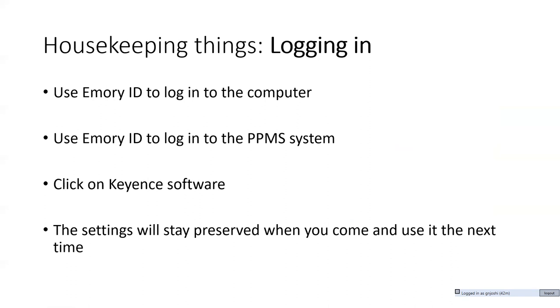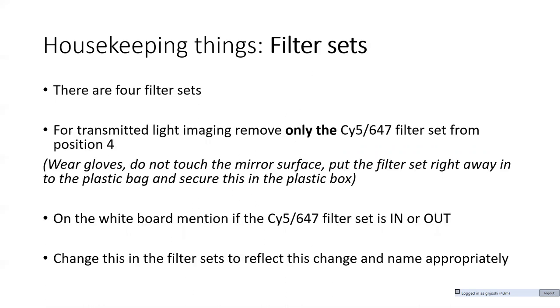All right, so some of the housekeeping things on this computer. The first thing is you use your Emory ID to log into the computer. Once you log into the computer using your Emory ID, you will need the same ID to log into the PPMS system. Once you are logged in, click onto the Keyence software and you're good to go. It's just that simple. Except for the first time when you are here, I will configure the system so that you don't need to do anything else, which is something I'll do tomorrow when you are here.